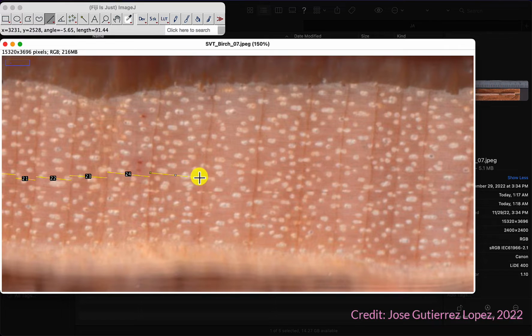Yeah, this part can be tedious, but if you really think about it, you're just literally going back in time. You can see this as a lame time travel from the comfort of your desk.